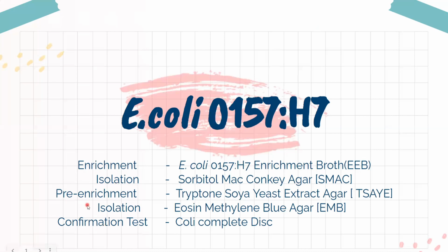The second method is a two-in-one wherein we can detect coliforms as well as specifically the E. coli O157:H7. And it involves three steps. First is the pre-enrichment using the TSYE medium, followed by isolation on the EMB, that is Eosin Methylene Blue agar, and the confirmation of the E. coli O157:H7 using the Coli Complete disc. So let's get into it.